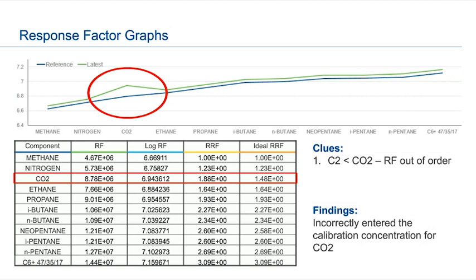concentration in. And so I would go back and look at my certificate value compared against that first, or I should really say the second column on my final calibration report, to see if they match. I could also pull up the component data table to see if my certificate of analysis from the calibration bottle matches what I put in the component data table. So this is just an example of somebody fat fingering something, or basically not typing it in correctly.